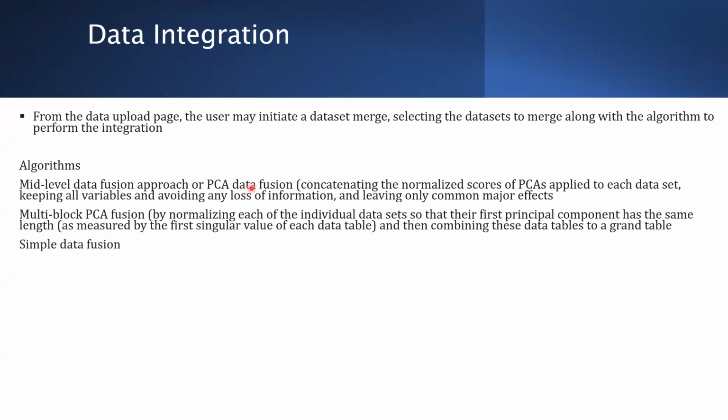So for the data integration, you can do a mid-level data fusion or multi-block or simple data fusion. All these things are explained on the platform if you're not really familiar with the names. So it will tell you how it's going to fuse, impute, merge, or integrate your data to make it one. So I'm going to stop here and share my screen showing the VIIME platform.